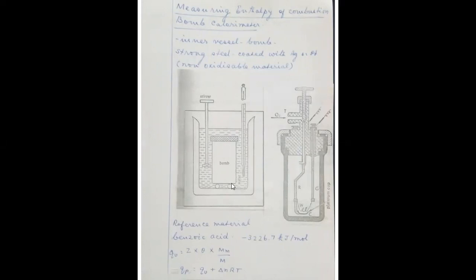Evacuated. Now, this is actually the bomb. So here is an oxygen supply and a screw to adjust the supply of oxygen. And here is a small tray, that is a platinum cup, in which the substance that is to be burnt will be kept. And here is a tungsten wire, and this tungsten wire is electrically heated to ignite the substance taken in the platinum cup.